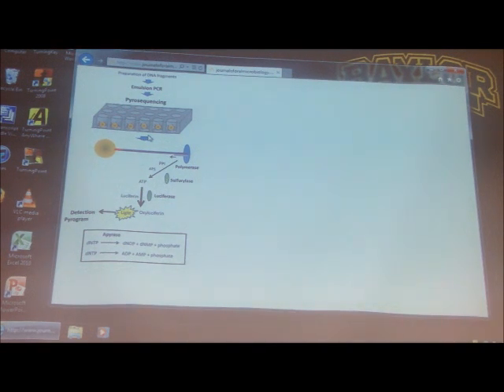The detector looks at that, the computer records it, and then we wash that dATP out of there, and then we put in the new one, which is not going to be dATP, but let's go to, how about, dGTP? That'll be the next one, and the computer keeps track of which ones have light. Flush it out, we put in dCTP, keep track of who has light, flush it out, we put in dTTP, who has the light, flush it out, and then we continue the process. So you're continually going through this process.